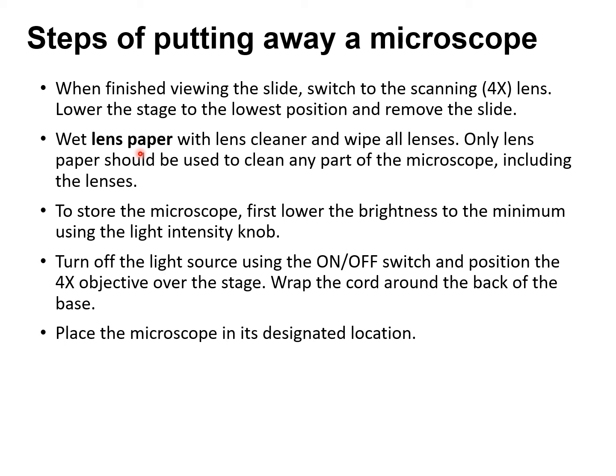Never use anything other than lens paper, okay guys? The lens paper is the only thing that you can use to clean your lenses. Anything else is going to scratch the lens and damage it. So never use tissue paper, paper towels, cotton, none of that. Only lens paper, to prevent scratching your lenses.